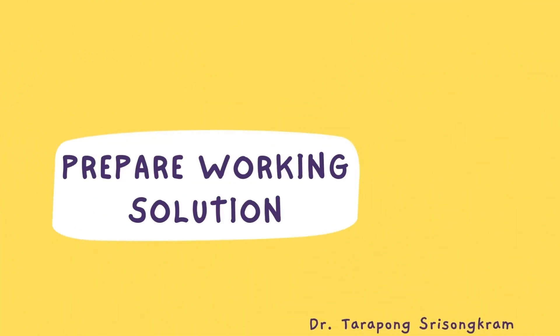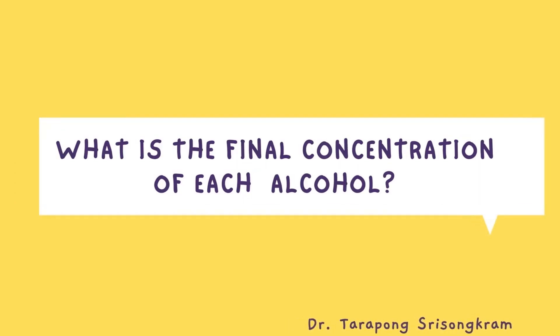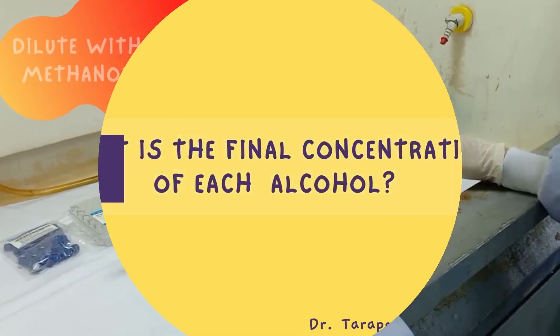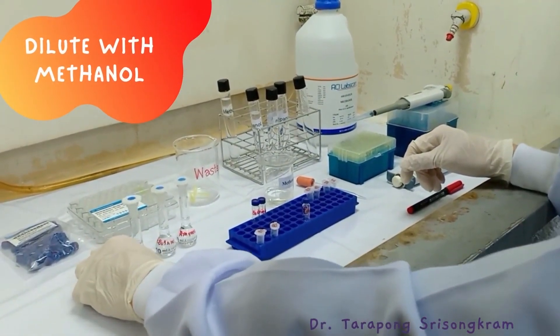After we prepare a stock solution, now we will prepare a working solution. Again, I would like to ask you: what is the final concentration of each alcohol? Please carefully watch the video and you will find the answer.